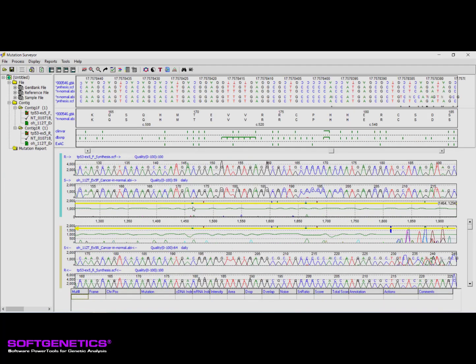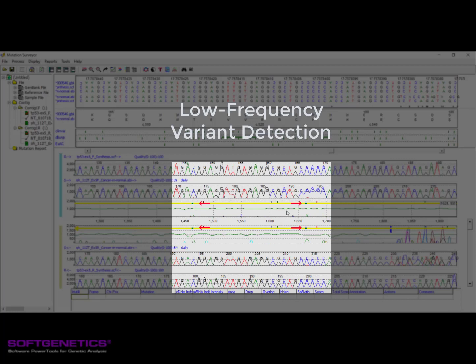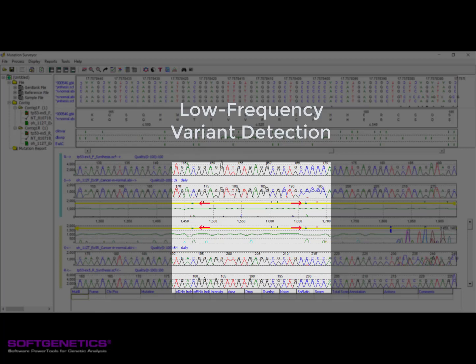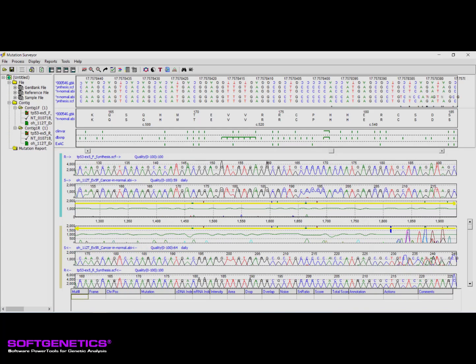Finally, small green bars will be placed at locations of possible low-frequency variants when the check 2D setting is selected in the mutation project settings prior to running the project and when paired bidirectional samples are loaded. However, it is important to remember that these are not considered called variants and would still require manual addition. Please see our webinar on low-frequency variant detection for additional details.